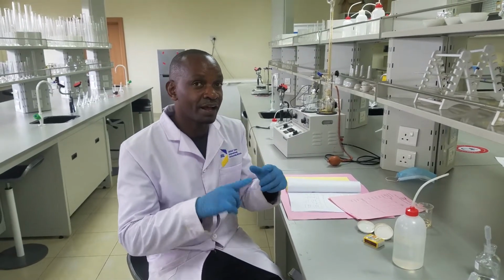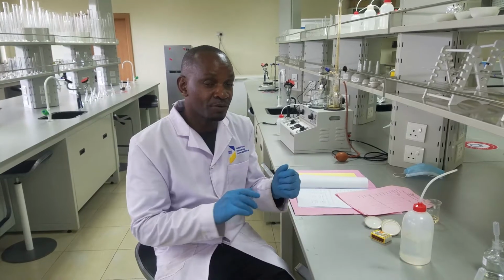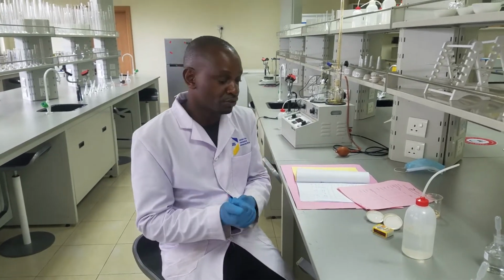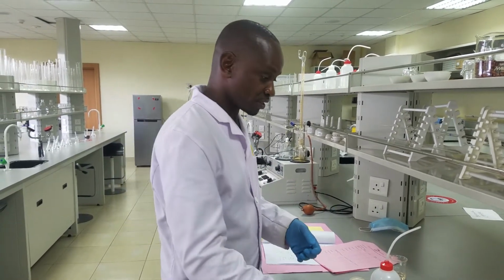Hydrocarbons with a higher carbon to hydrogen ratio have high soot, as compared to hydrocarbons where the ratio of hydrogen and carbon is almost the same. Those have less soot. So this is what we are going to test now. And for me to do combustion, I will use a crucible lid. It is easier because it's easier to see whether there is soot forming or not.